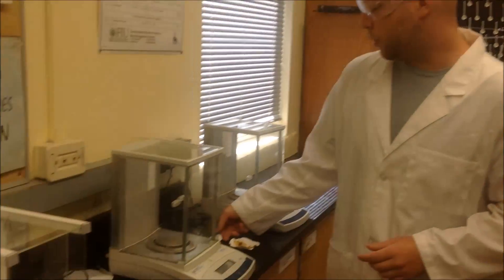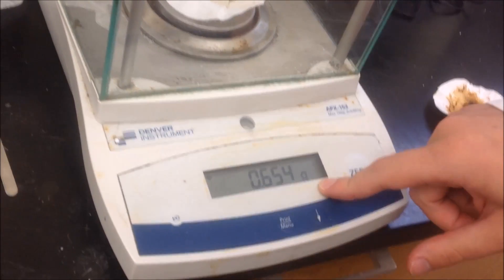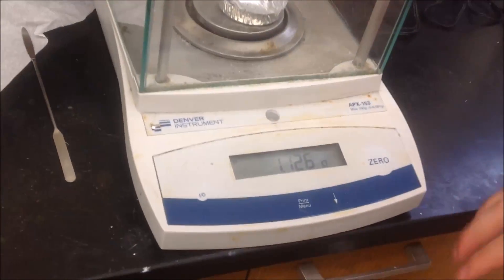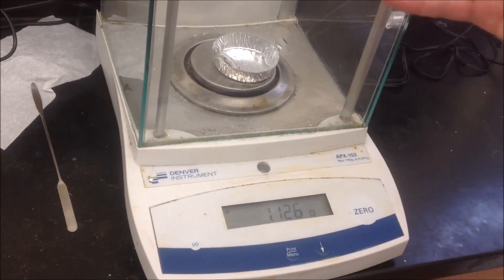Now we're going to weigh out the second-hand smoke filter paper, and it comes out to about 0.654 grams, which is only about 0.012 grams higher than what we saw earlier. So this is showing that there's about five to six times more solids going to the first-hand smoker than to the second-hand smoker. Now that we've finished burning the unfiltered cigarette, we have the ashes collected into our little tin, and we're going to put it on the balance to see how much is left. Shutting the door, we have approximately 1.126 grams — keep in mind this includes the little tin, so we have to subtract the weight of the tin.